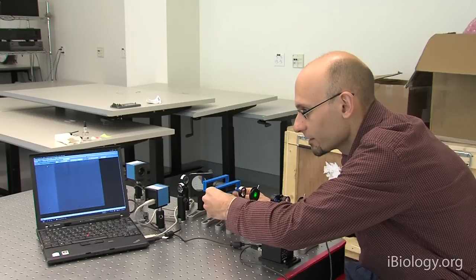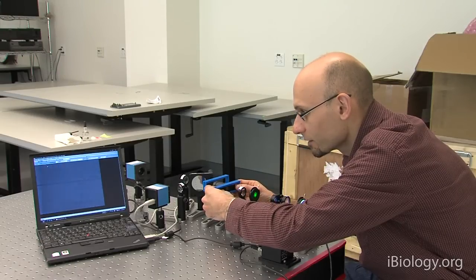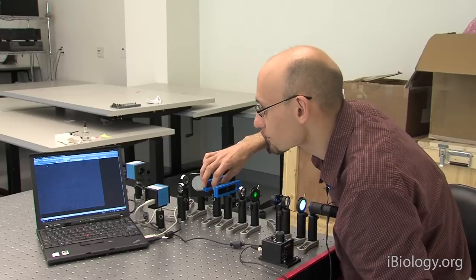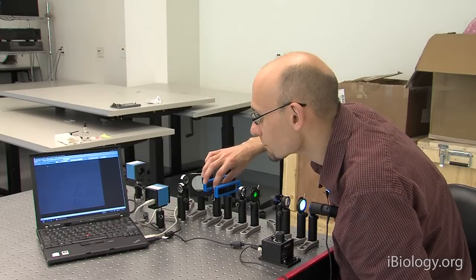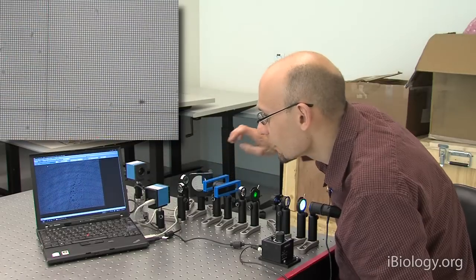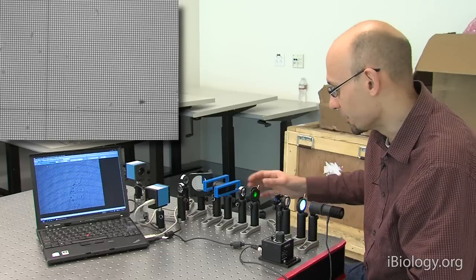And get that in focus. OK, so now we have a nice image of a 2D grid here.